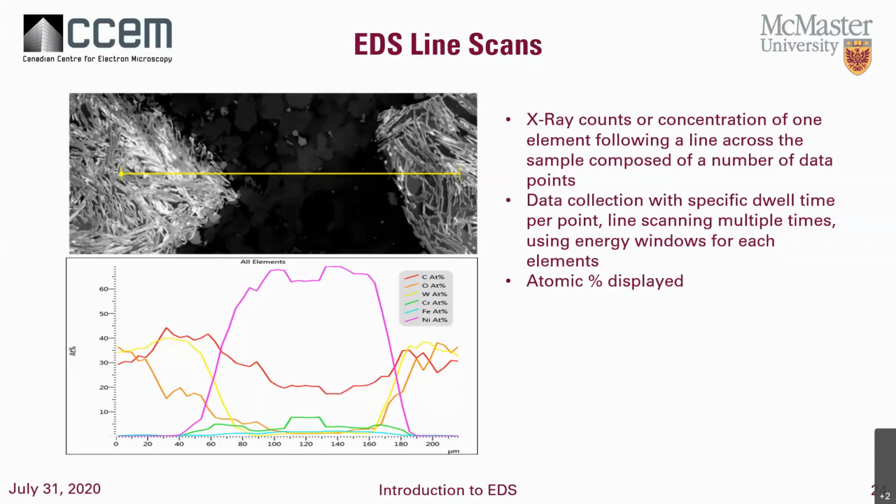It may not have been so obvious in some of the previous analysis, but here you can see that. And you can see the nice distribution over the distance, in microns versus atomic percent, across the line. Now, this has also been processed a bit, so there's been some smoothing. We've also done what's called binning and combined some pixels or data points in this material.